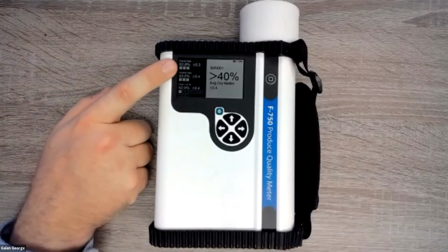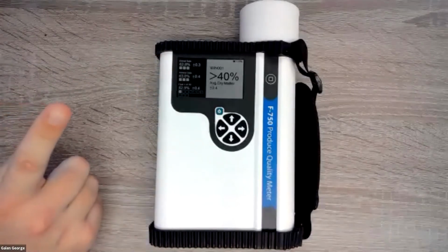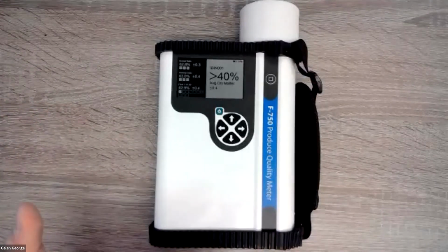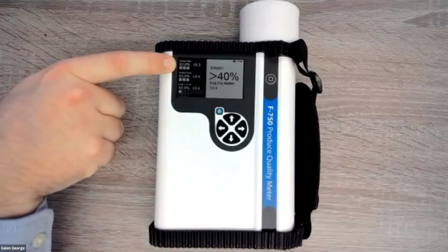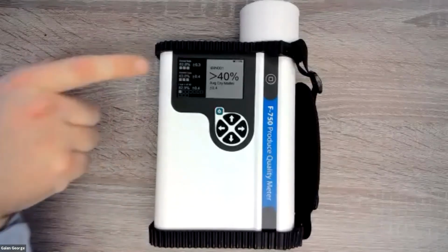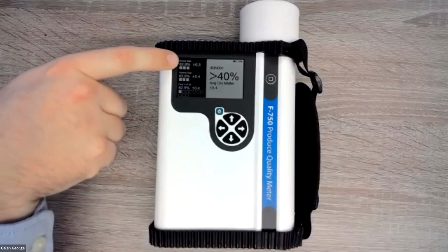I have it set to automatically take 3 scans with a single click of the button. So I click the button once, and it'll scan three measurements in a row and average those, which is this number right here, and it'll also give you the standard deviation, which is that number right there. Same with the ventral side. So this is a 2-sided measurement.